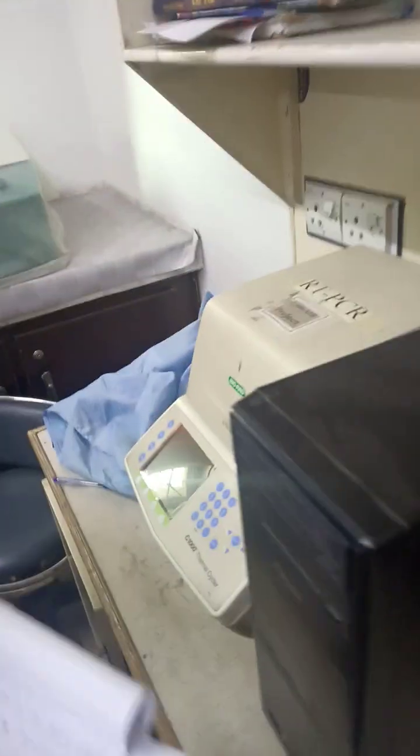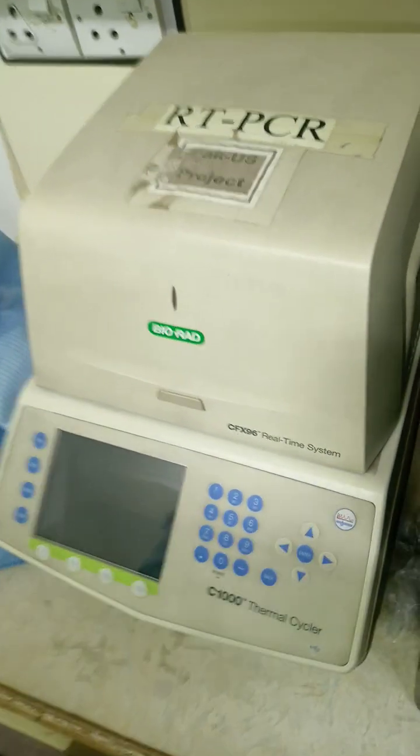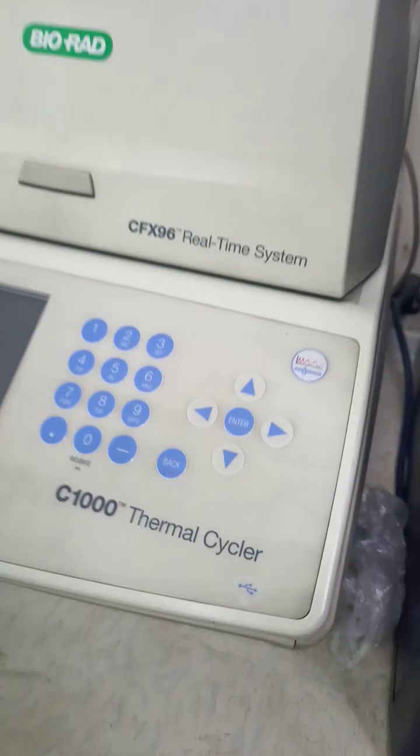Real time. Yes. You will take a photograph. It's real time or quantitative? It's real time as well as quantitative. Both. It's one machine or two? It's one machine. It's always one machine.